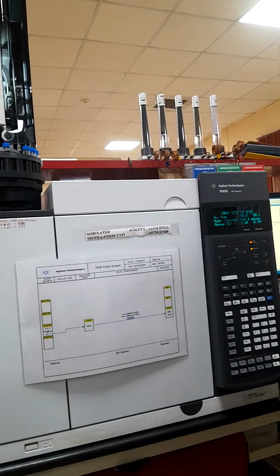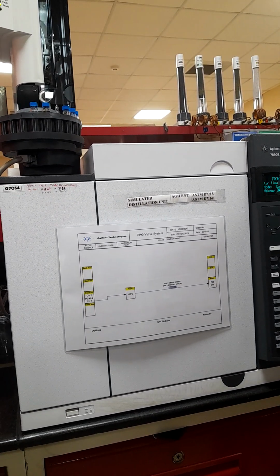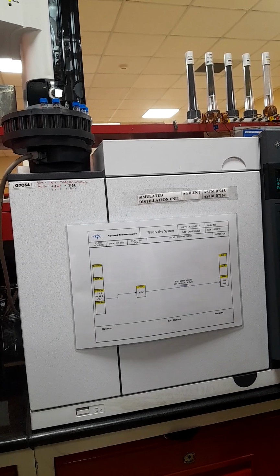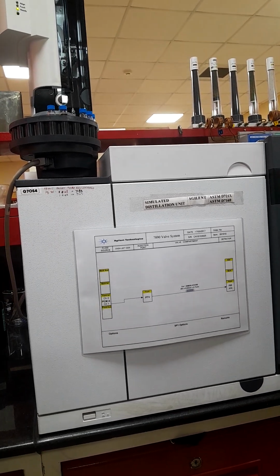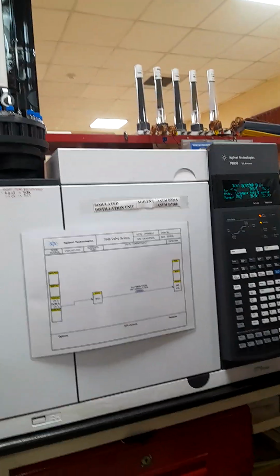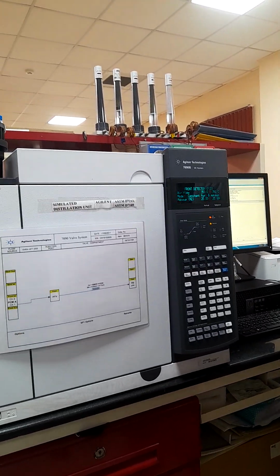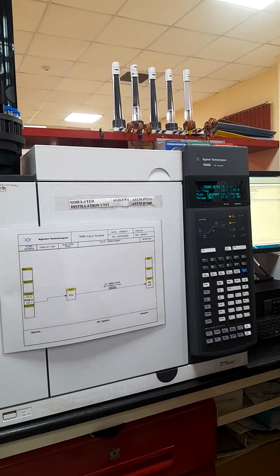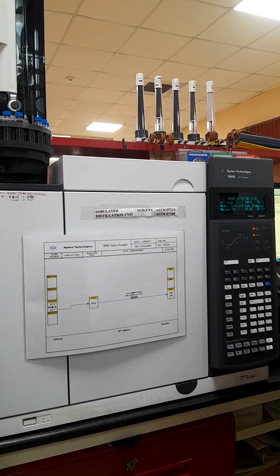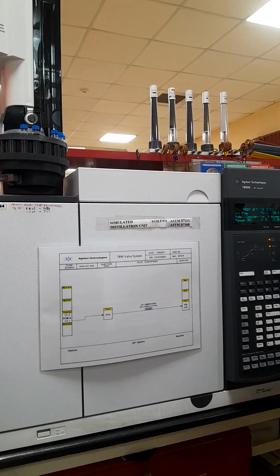So you have the compressor here, but you also have the zero air unit connected to the compressor. That is there, but we are not getting high purity from that. We get moisture content in there. Those generators come with the filters and everything built in, but still we cannot trust them, since it is not certified. To get certified gas, we have to trust some vendors or manufacturers who will certify and test the gases, how much purity there is and what other impurities are there. So they will post everything.